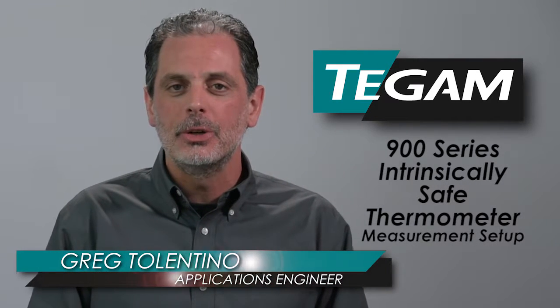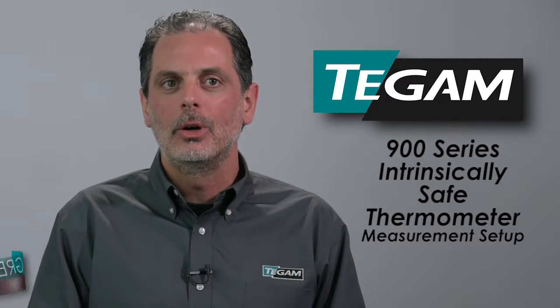Hello, Greg Tolentino, applications engineer at TEGAM, back to show you how to set up your 900 series intrinsically safe thermometer for measurement.